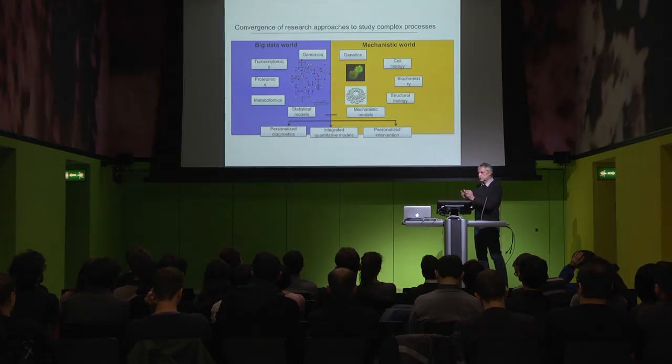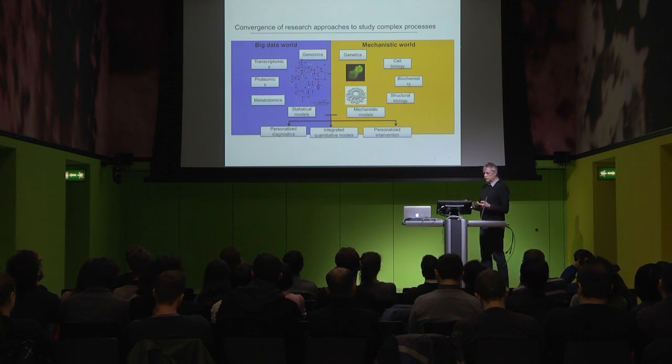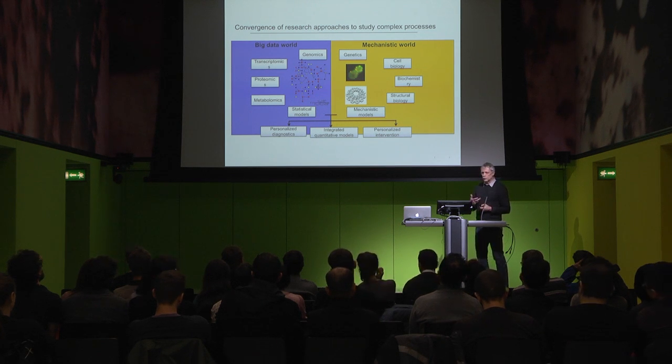And I think these examples now are bearing out, this is a very small example, of course, but I think it's bearing out the notion that we now can use, or we should use, large-scale data approaches, big data approaches in proteomics, but also small-scale data approaches, mechanistic data, and somehow combine them. And of course, the challenge will be to do this in a particular biological context. But I think through the tools we discussed this week, the targeted proteomics, we now have in proteomics the tools to do this actually at both levels.